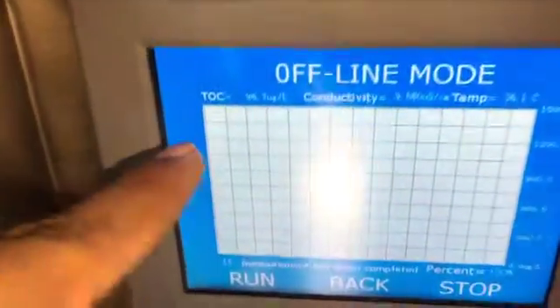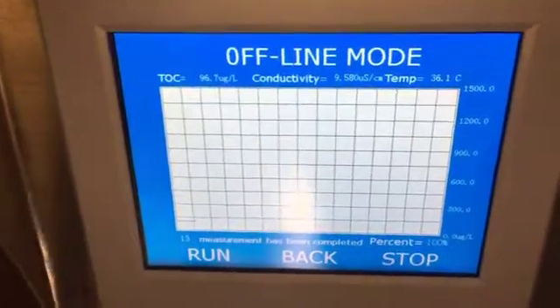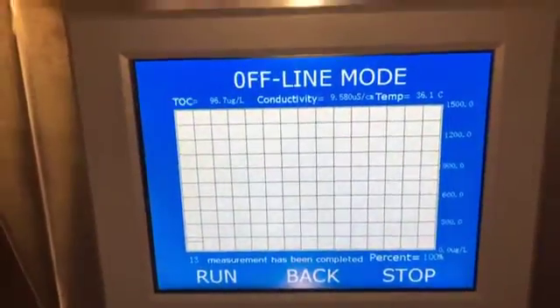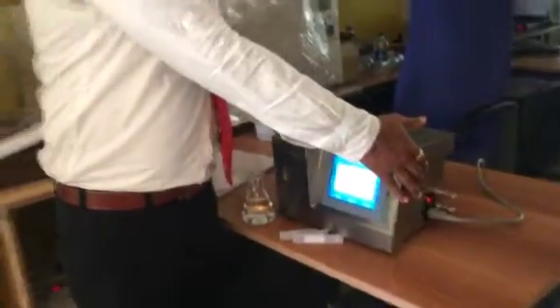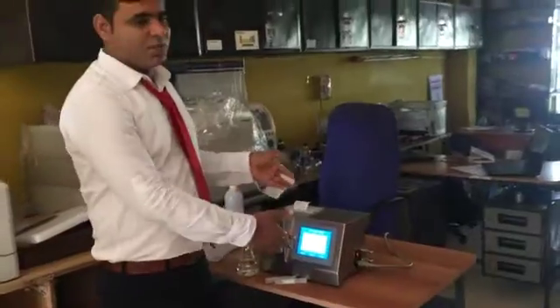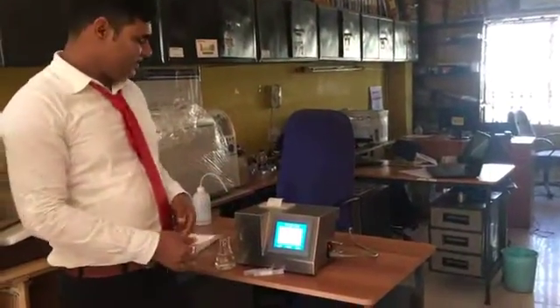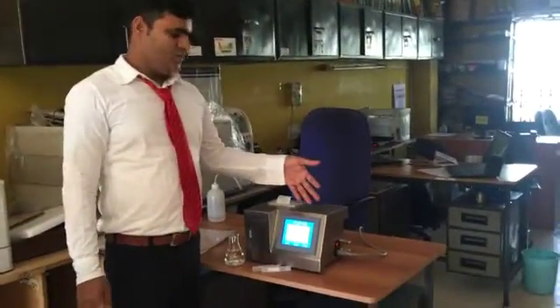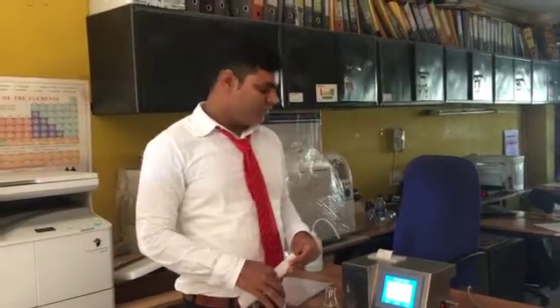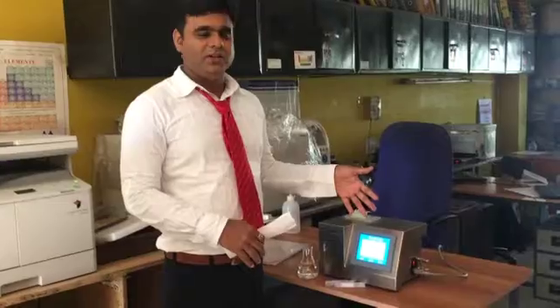The second test is now also completed — the result is 96.7 micrograms per liter, confirming a reproducible result for the same sample. The machine is very easy to operate, easy to feed the sample, and very small — just 3 to 5 kilos — so you can carry it anywhere. For enquiries, write to us at info@hpstechnologies.com or info@analyticalgroup.net — we welcome your suggestions and enquiries.